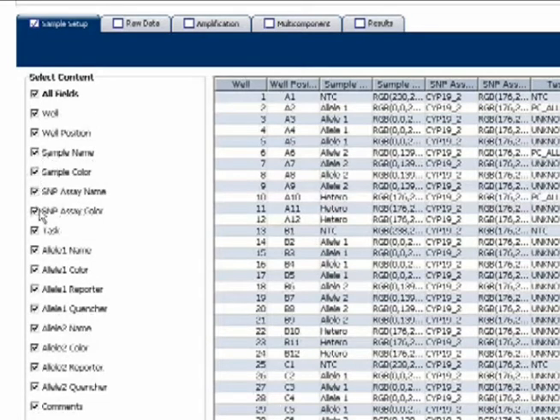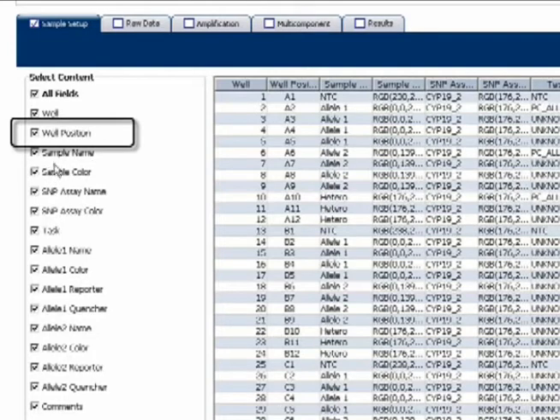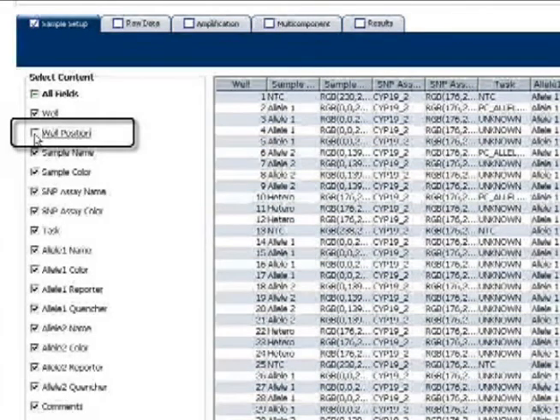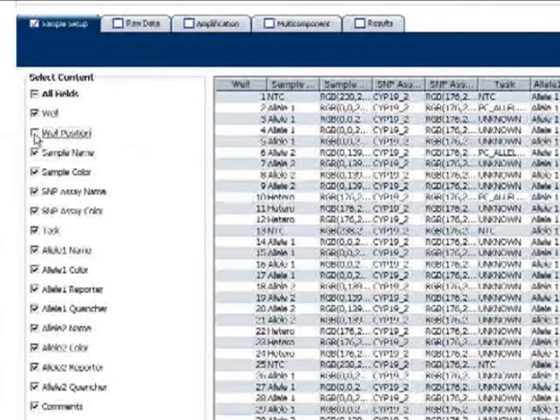And in fact, here's one very important piece of advice. Uncheck the box next to Well Position, as this will prevent a successful import.